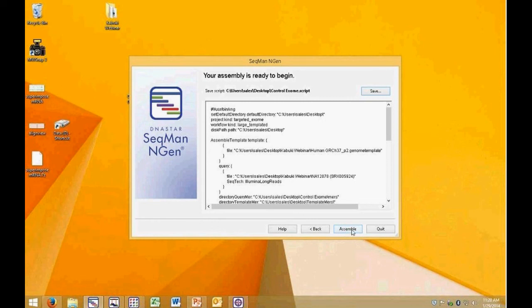I won't actually run this assembly here today, but instead I'll now switch into our SeqMan Pro application unless there's any questions.